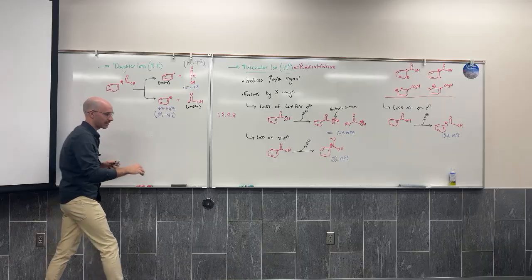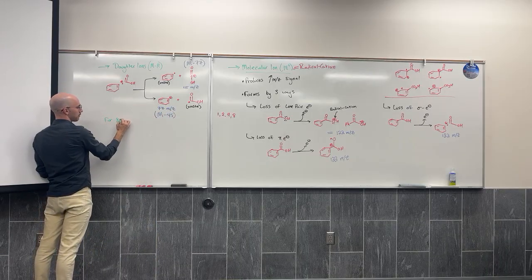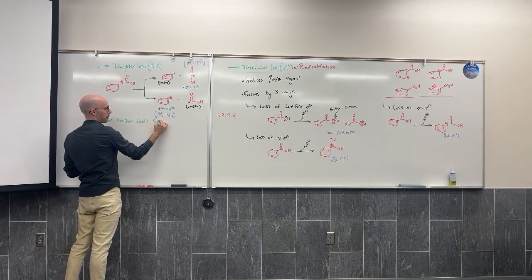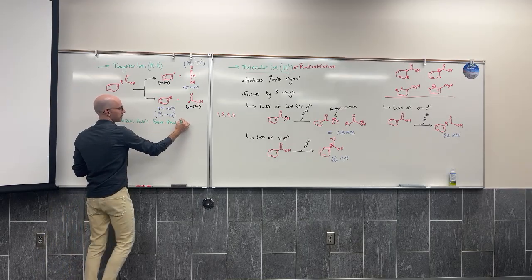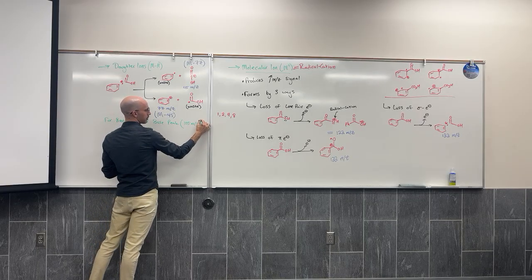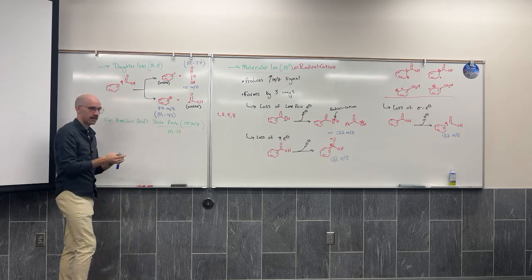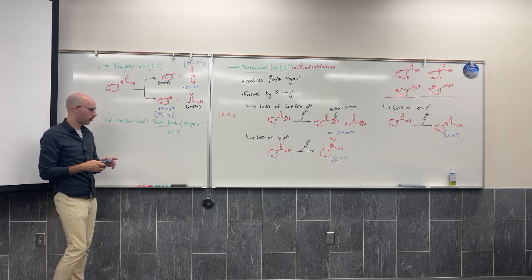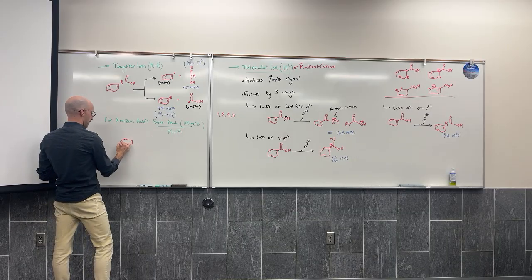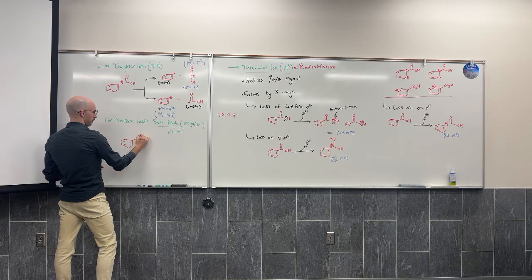So just the last thing here for benzoic acid's base peak. Which is a base peak at 105 mass per charge units, or in other words, M minus 17. I must have lost OH. Where do you think that OH came from? It's fine. You don't actually have to answer.